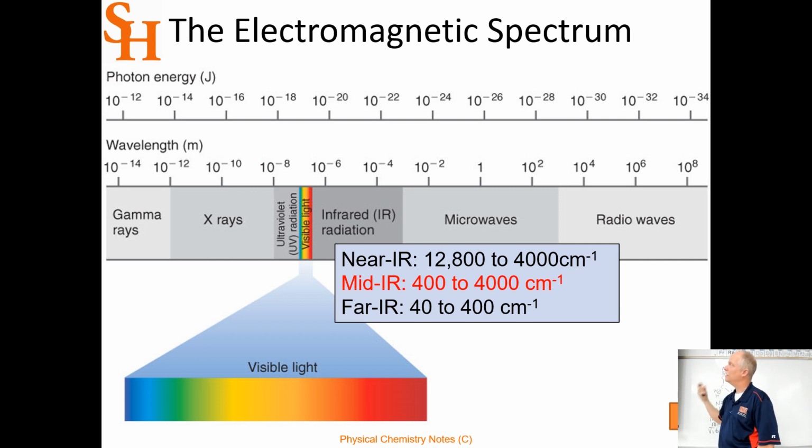Going to low energy, we get into the microwave region where we have rotation of molecules. So the whole molecule is rotating. I mean, you might have said, well, wait, I just thought we were talking about rotation of CO in the mid-infrared. Well, that's why if you look at the lab handout and look at the lab for next week, it's called rovibration. It's rotation on top of a vibration. But in microwave, it's pure rotation. You're only rotating the molecule. You're not vibrating it. And that only works if the molecule has a permanent dipole.